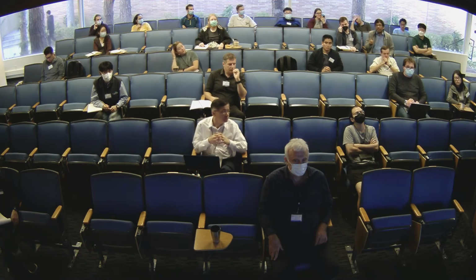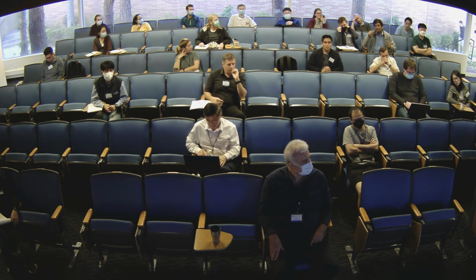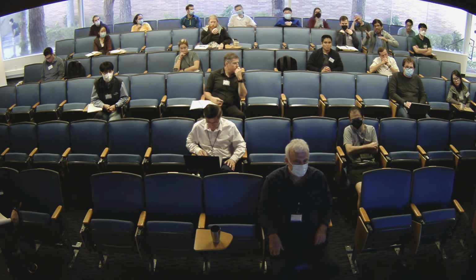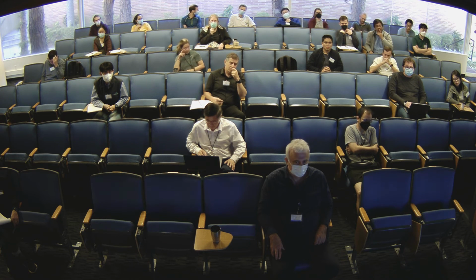Yep. So, the reconstruction looks really good. I'm wondering whether this makes sense or not, because for instance in Alex you can see you have a video, right? But in microscopy there will be interfaces. So I'm wondering whether you lose spatial resolution at the boundaries, or the sharpness of what you will be able to see, or not.